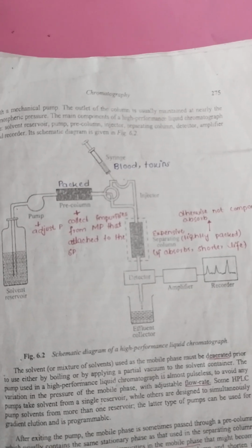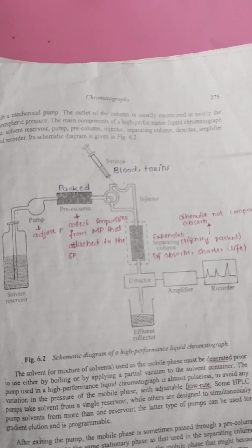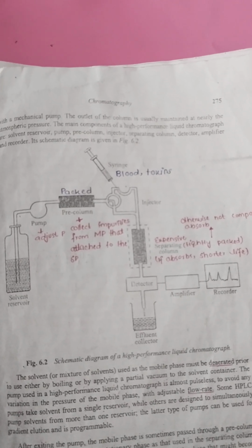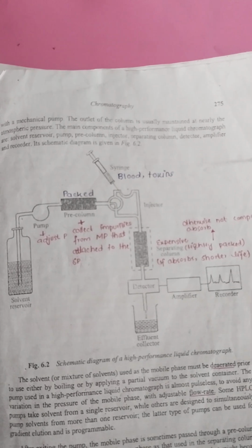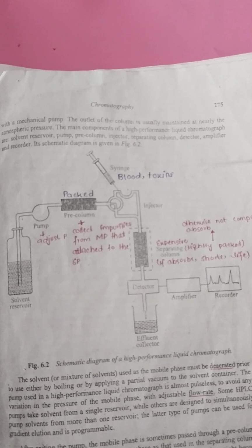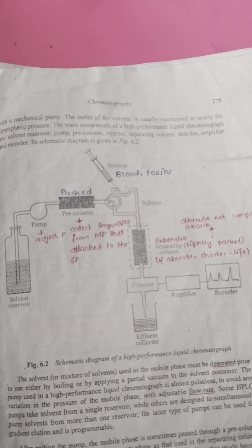Now we explain: both columns are used, and the stationary phase in both columns is the same. Why do we use two columns? Because the pre-column absorbs impurities from the mobile phase that would attach to the stationary phase, and the separating column is an expensive column. If impurity attaches to the stationary phase, it shortens the life of the separating column, or it is absorbed irreversibly. That's why we use a pre-column that collects impurities from the mobile phase.